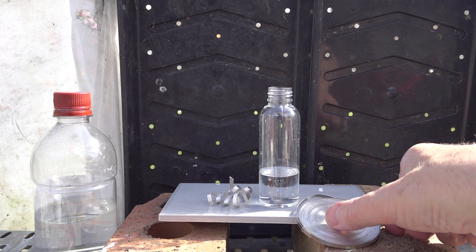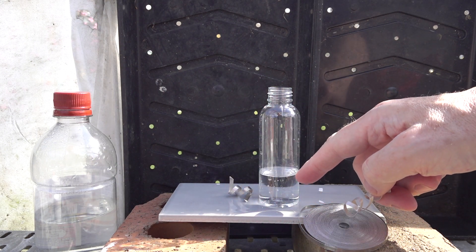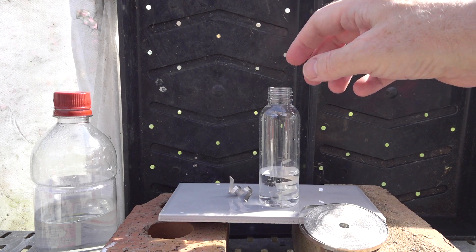Testing gases. Here we've got some magnesium ribbon, a nice little cooler, and we're going to place it into the ethanoic acid — the vinegar. In it goes.